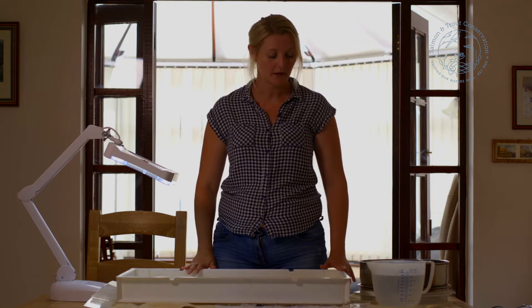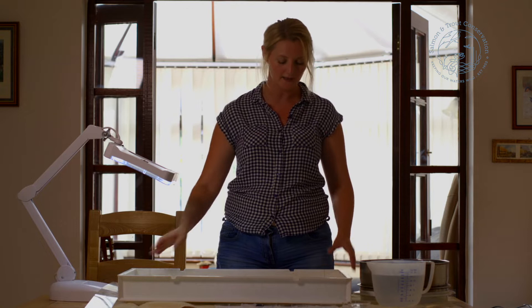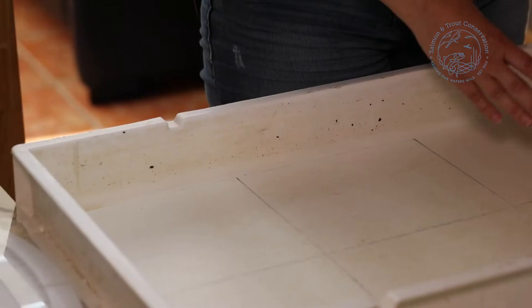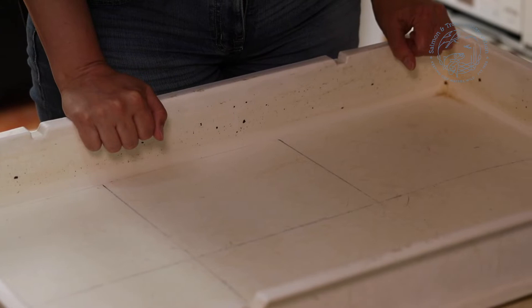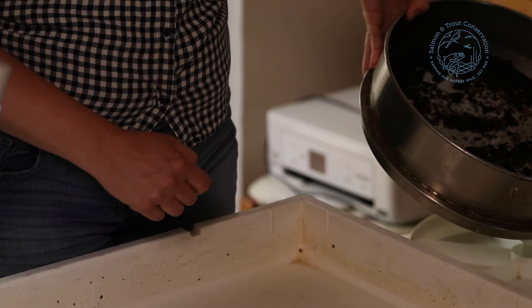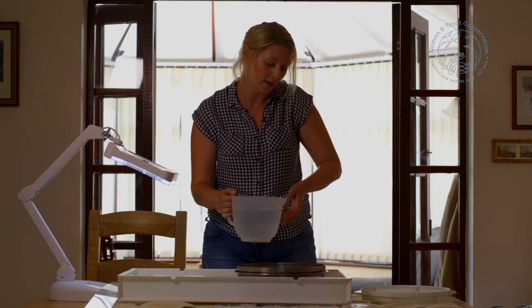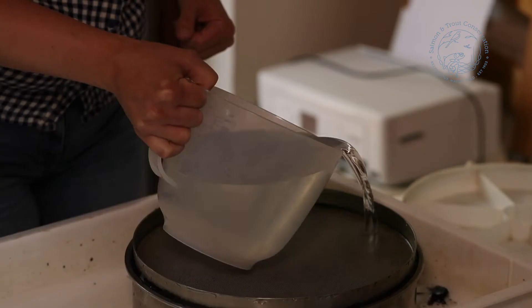Now we need to put our sample into our tray. Because I'm doing a full sample, not a partial sample, I'm using the big tray which has grid lines in the bottom, although I will be using my dividers later on so that we can section out the search. It just makes it easier to make sure you've covered every area of the tray. Now we've washed all of the preserving alcohol out, we just need to tip it over into the tray and use a jug of water to wash through.